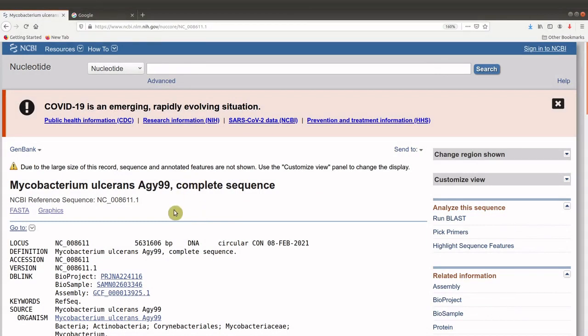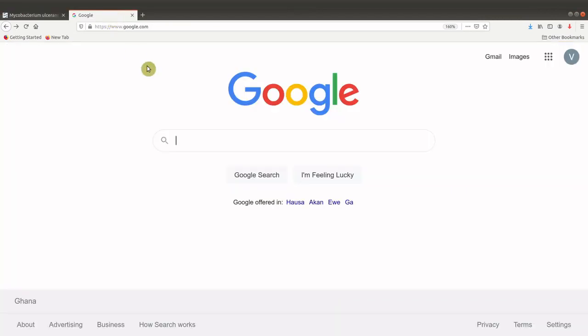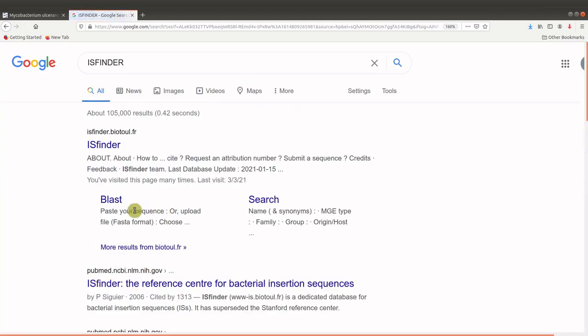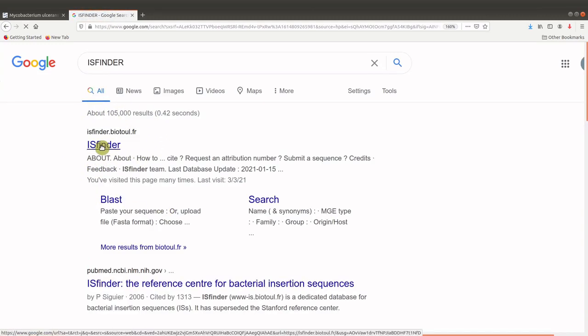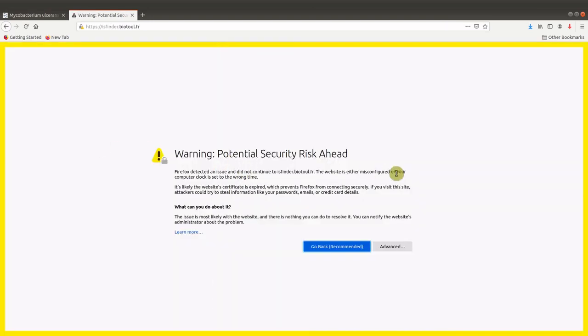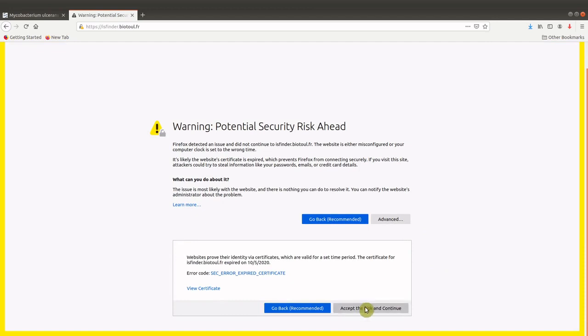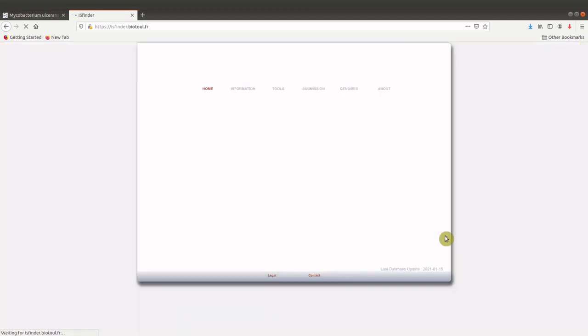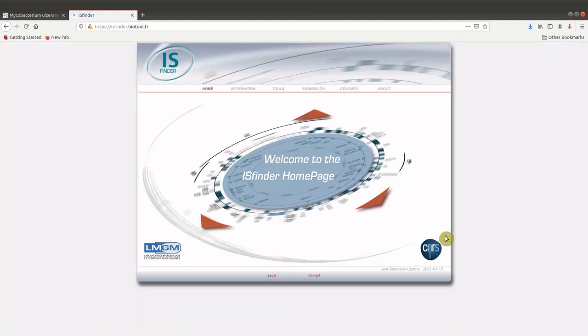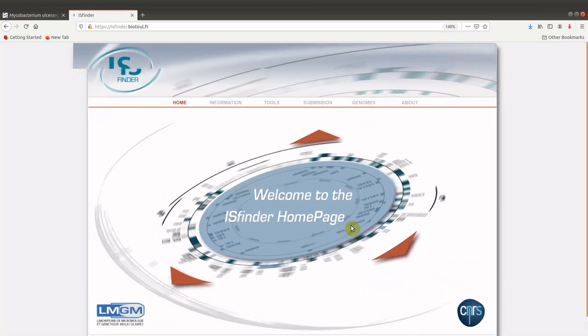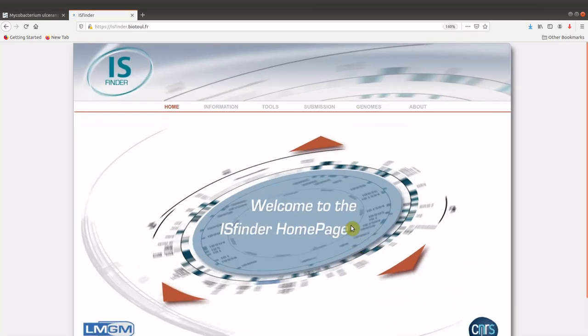Or you have your genome, then you can proceed to the ISFinder. I will Google for the link here. So this is the link for the ISFinder, you will visit that site. This is just a warning I got from the browser I'm using, but I will skip it and go to the ISFinder site because it's a legit website. So this is the homepage for the ISFinder.